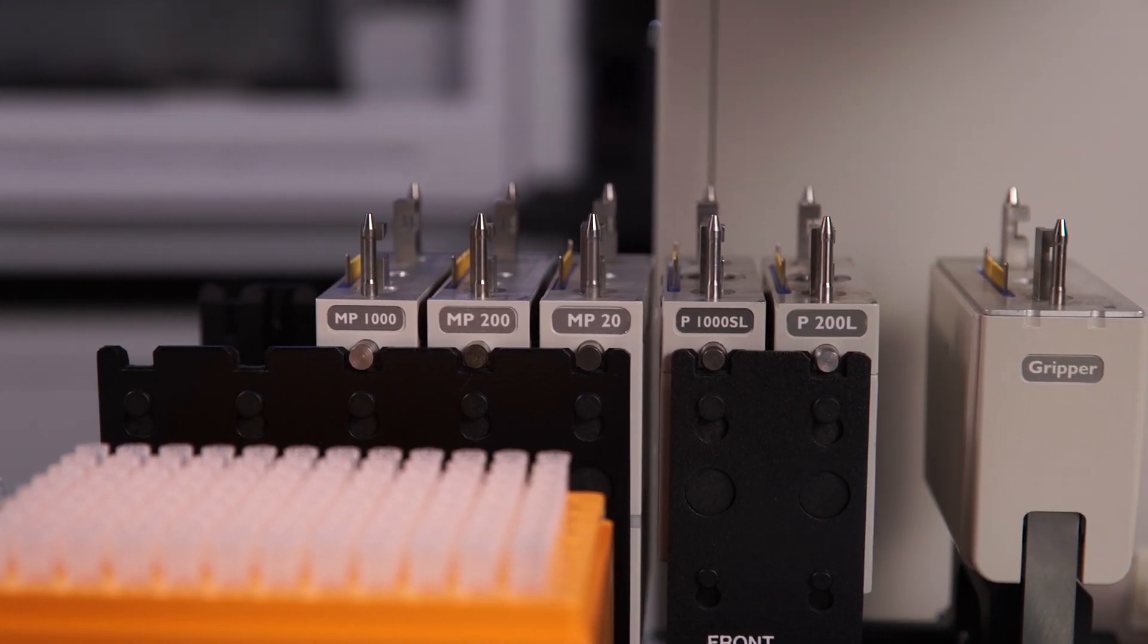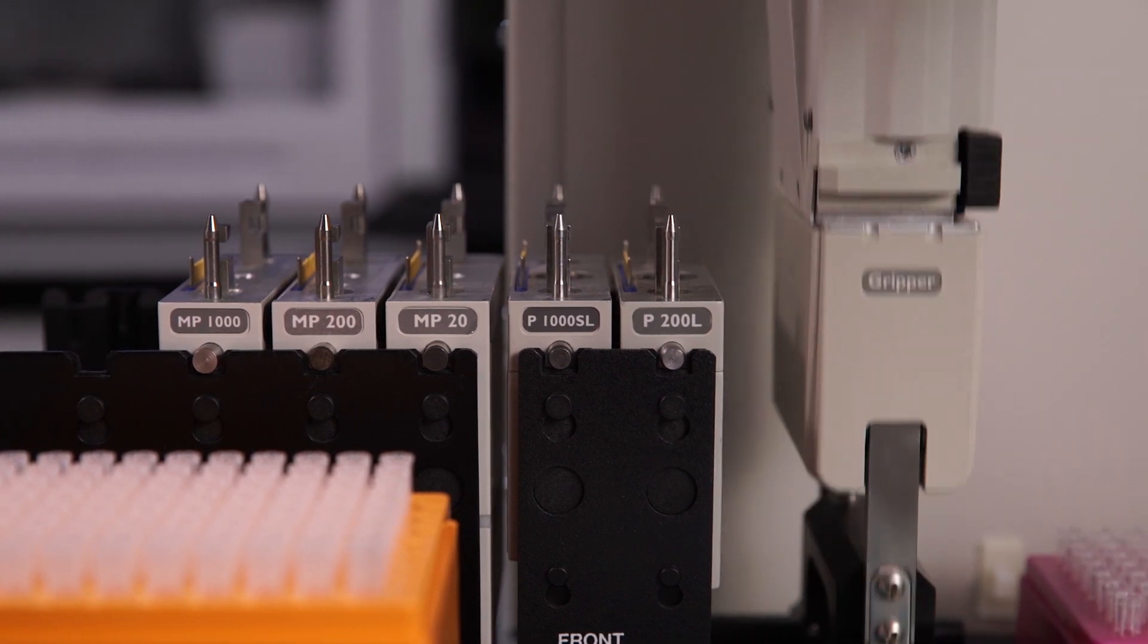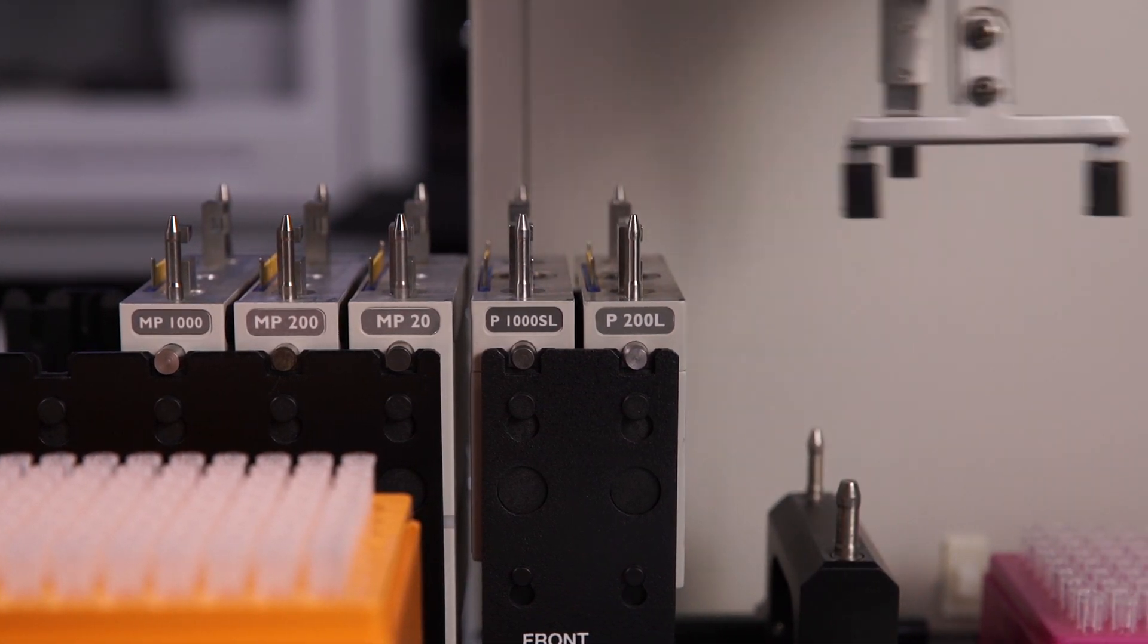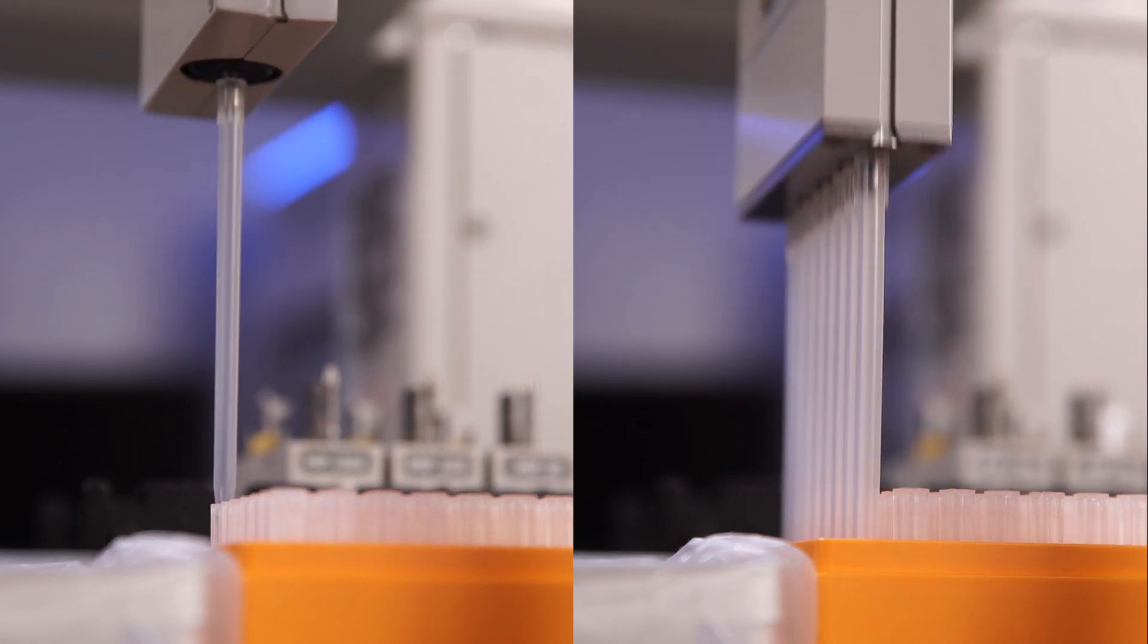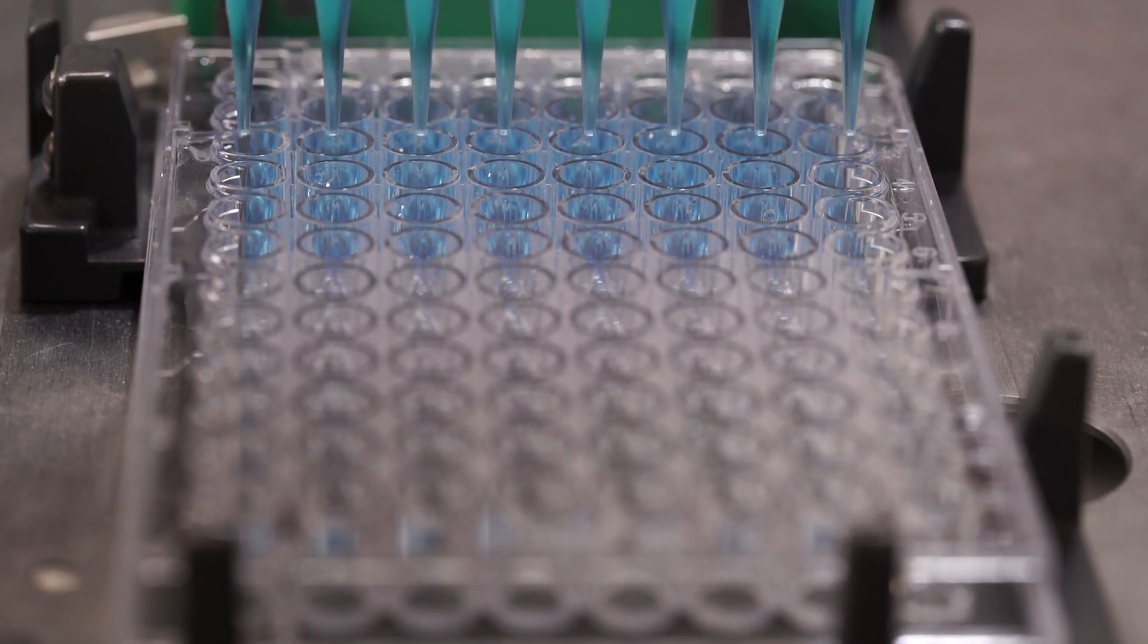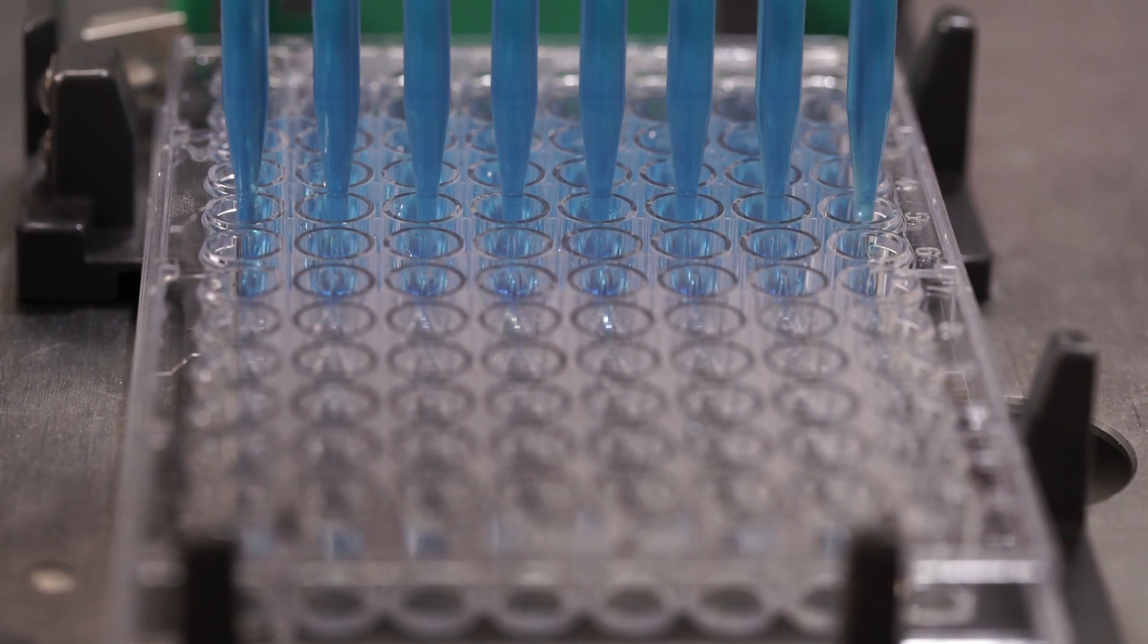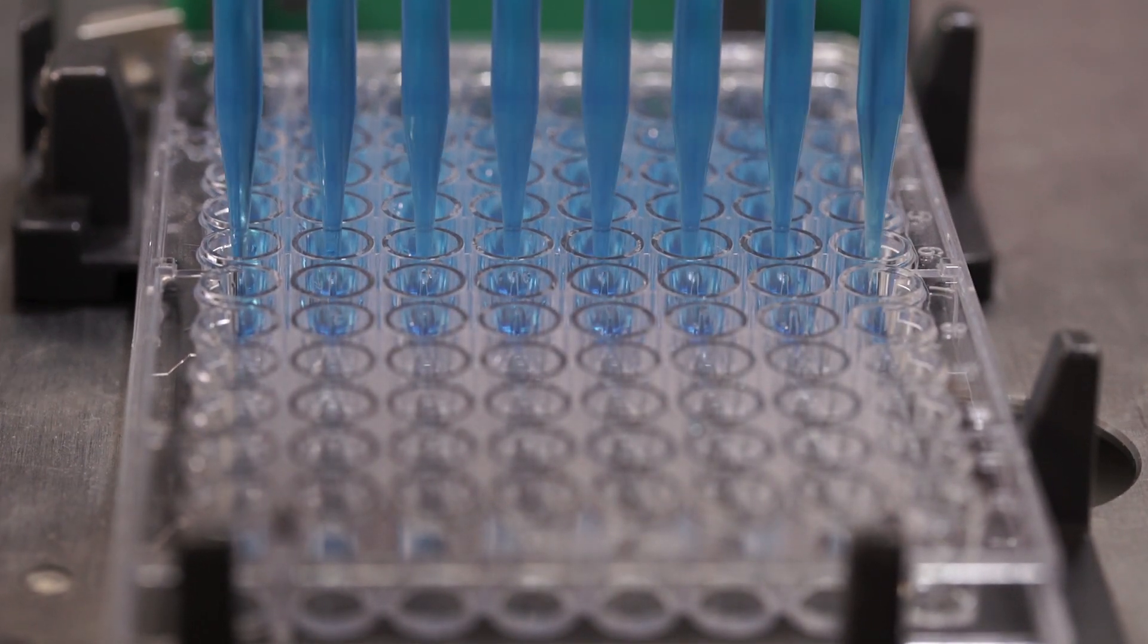The Biomech 4000's integrated tools provide a dynamic pipetting range of 1 to 1,000 microliters while offering the flexibility of single or eight-channel pipetting. This provides the ability to run small and odd-number batch sizes without the dead volume penalty associated with multi-channel systems.